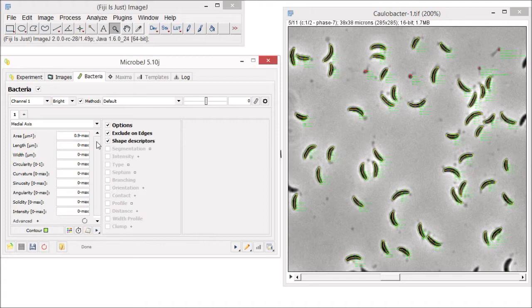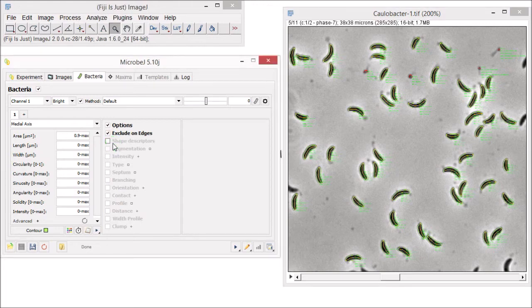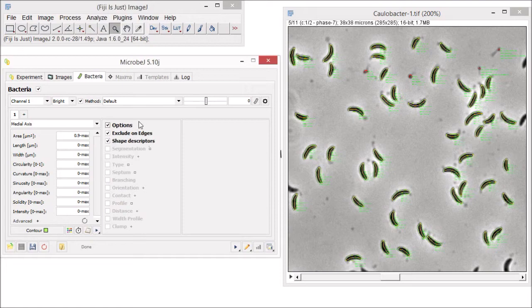When you are done optimizing cell detection, you can now select different options to analyze your cells. For example, if you are interested by the length, the width, or any shape attribute, select shape descriptors and all the attributes will be listed in the raw data table.